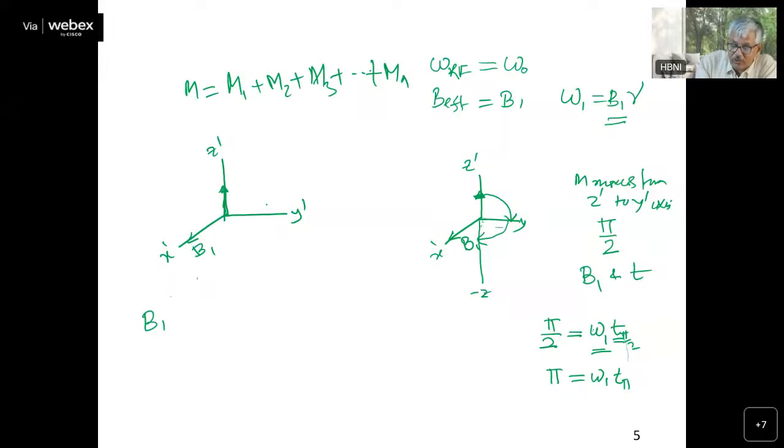As soon as this matches with this, that component is matching, because we will be using a very weak B1 field. As soon as it matches with this M1, those nuclei will be tilted and detected, and as soon as it passes that resonance, you will not see any signal. Then when it comes to M2, you will see like that.